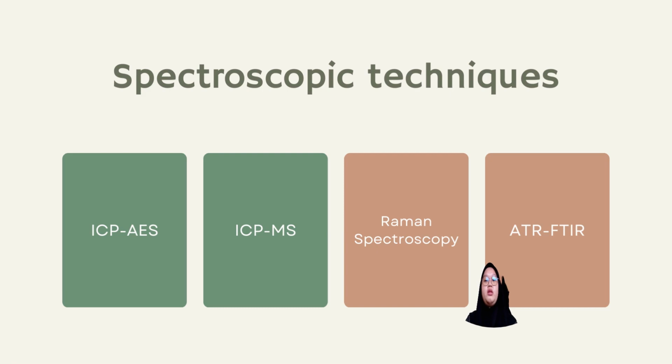Vibrational spectroscopy, which are Raman and IR techniques, are non-destructive and have imaging capability. They are based on instruments that are simple to use and no sample preparation is required. Vibrational spectroscopy combined with chemometric data processing is commonly used in forensic examination.